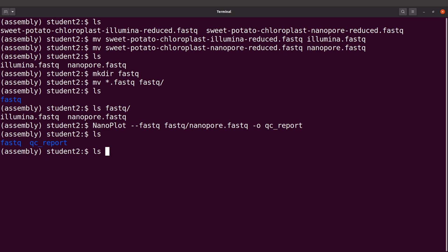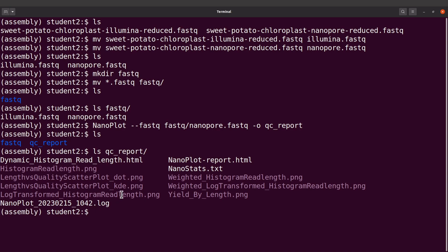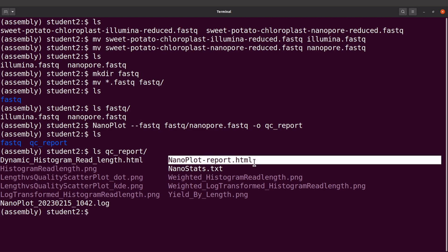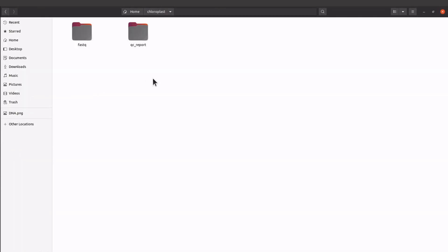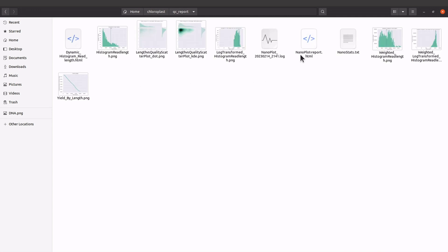In the reports directory we'll have some files, but I would like us to open the HTML file using our browser. I'll open this one here. Before that, there's also some information in the NanoStat .txt file — maybe we can start with that first.